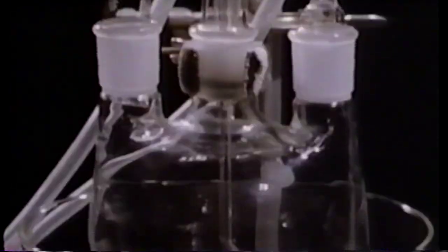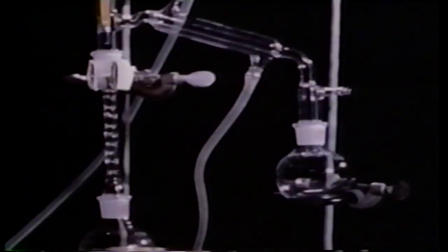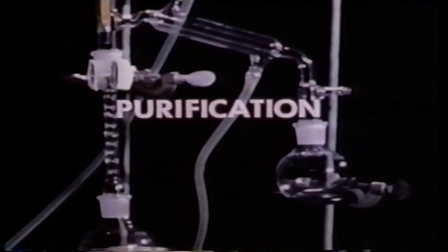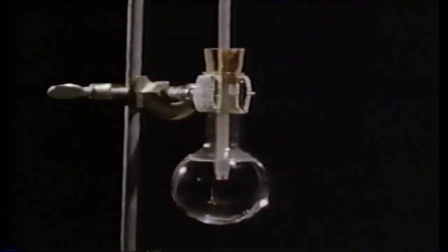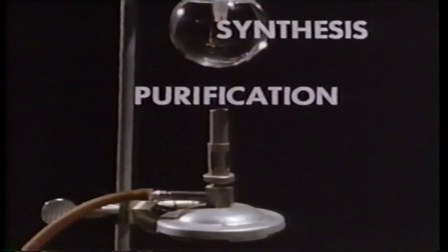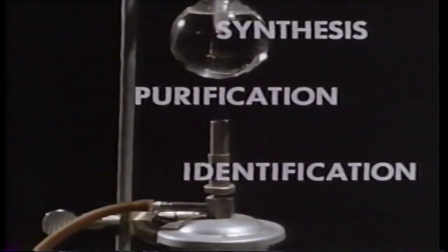The reagents will be mixed together in this reaction flask, where the alcohol will be oxidized to the ketone. This is the synthesis. Purification of the ketone will be done with this distillation equipment. The identification of the product ketone will be confirmed by infrared spectroscopy and by nuclear magnetic resonance spectroscopy. Synthesis, purification, identification: key steps in making any new organic compound.